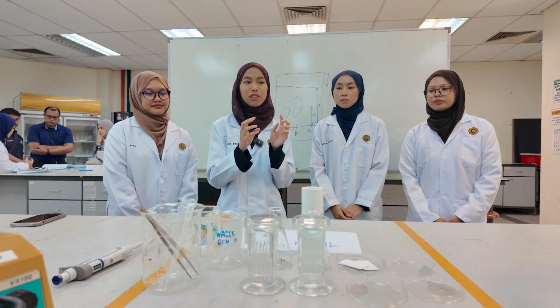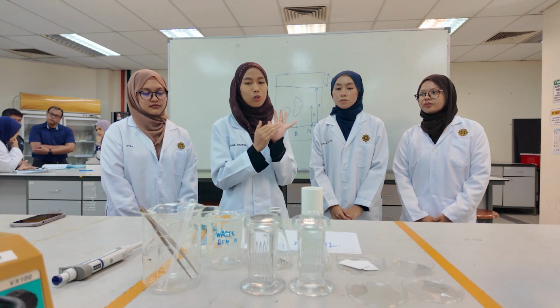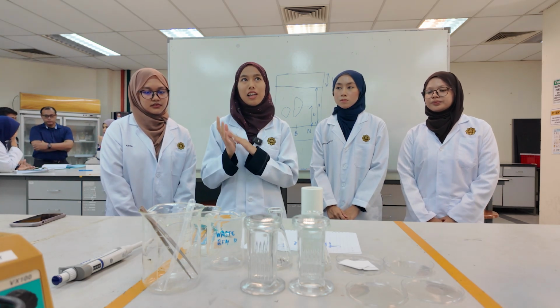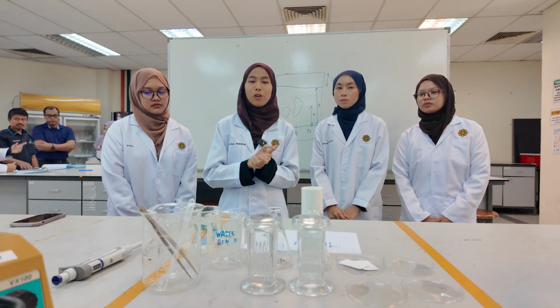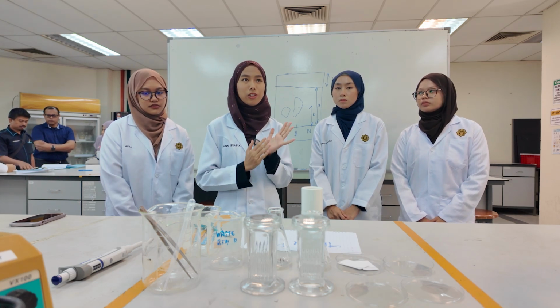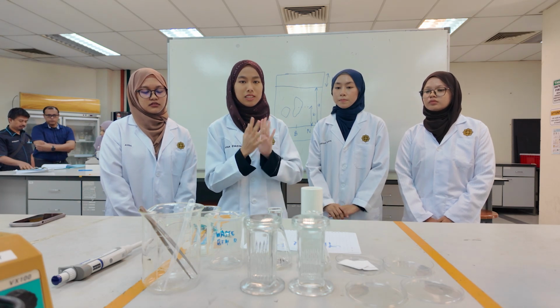Therefore, the high polarity compound will always stay at a lower level of the TLC plate, while a less polar compound has less interaction with the stationary phase. Therefore, it will move further up the TLC plate, or move faster through the system.